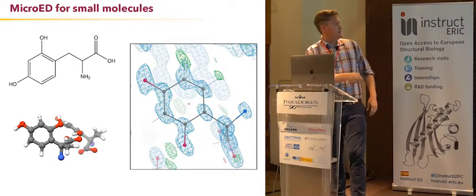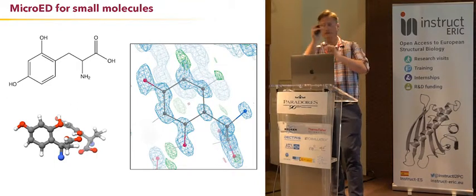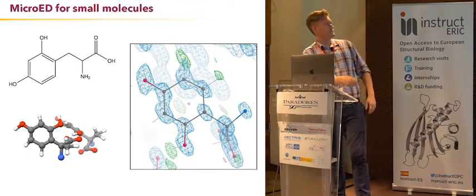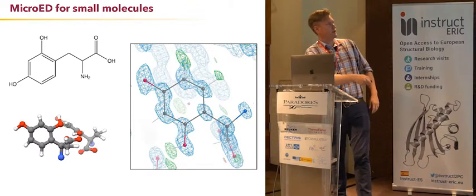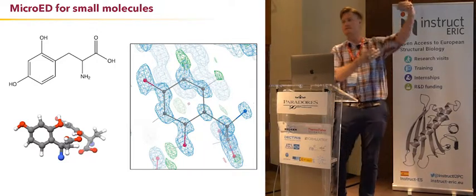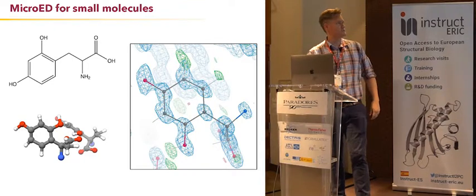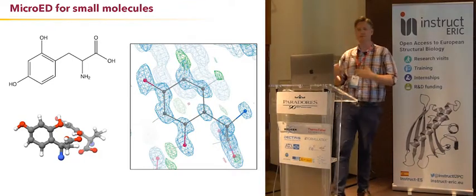We placed a lot of these hydrogens just sort of within ShelXLE. We kind of placed them in the peaks. But you can see if you remove the hydrogens and look at the map, there is density for a lot of these hydrogens. You can see here this hydrogen right here coming off the hydroxyl makes a hydrogen bond with the next carboxylic acid group and the next one over. And so you can see a lot of these densities for the hydrogens. We don't see all of them, but we do see some hydrogens.